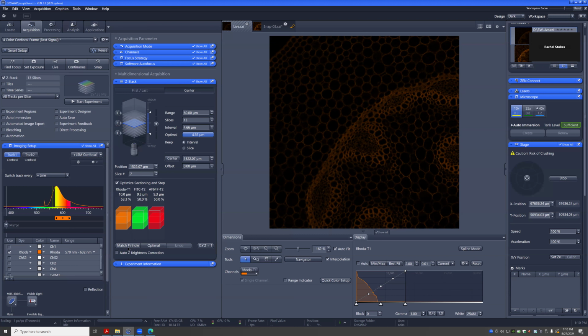What it basically does is it sets an optimal pinhole for all of the tracks. You could ignore it and just have your pinhole set in each channel to the node, basically optimizing it for every individual track. Starting out, I'd say that's a good point to begin because you would have the best possible settings per individual track.